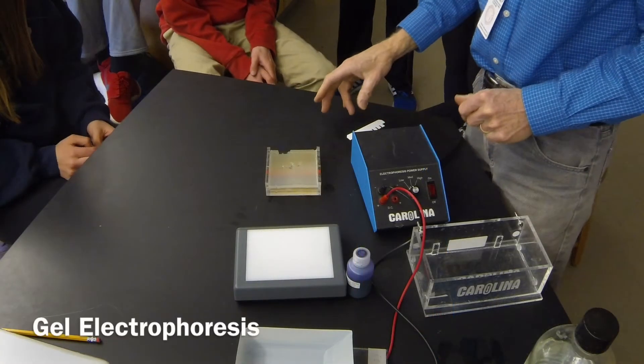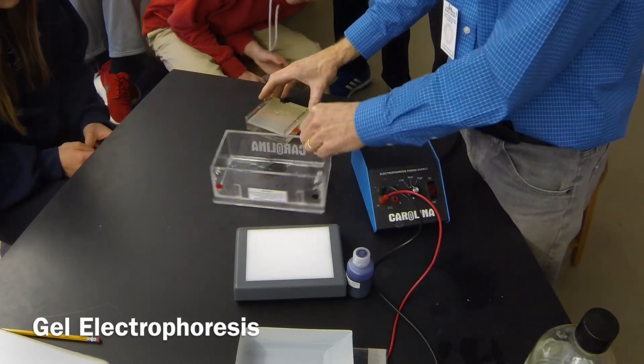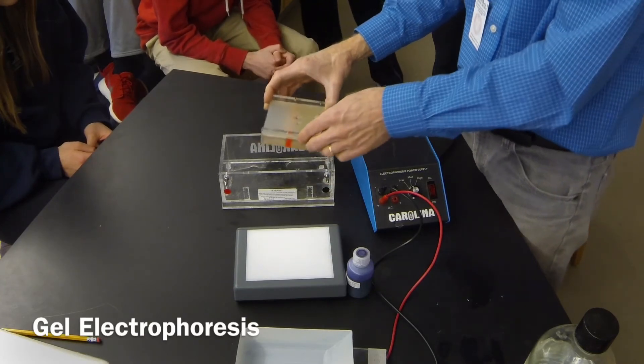Before I do this project, I'm just going to show you how it works. I take the DNA from Emma. I put it in one hole and then I got the DNA from the computer in another hole.